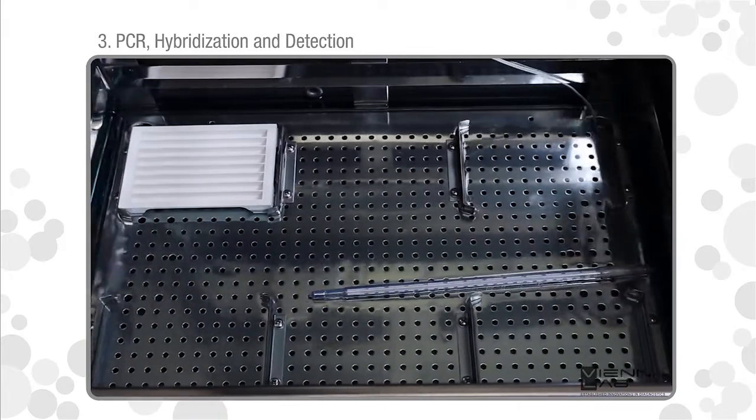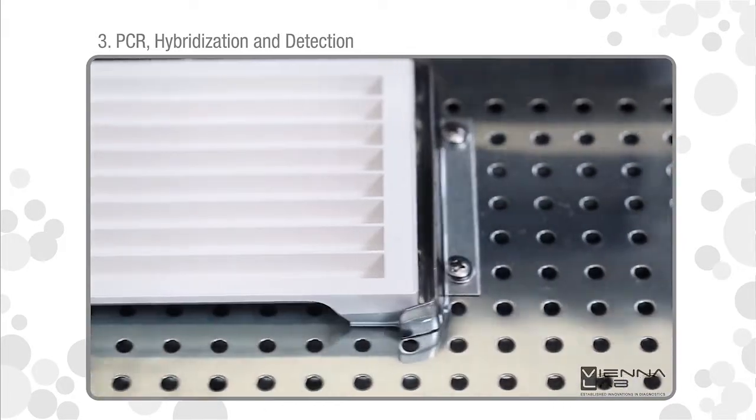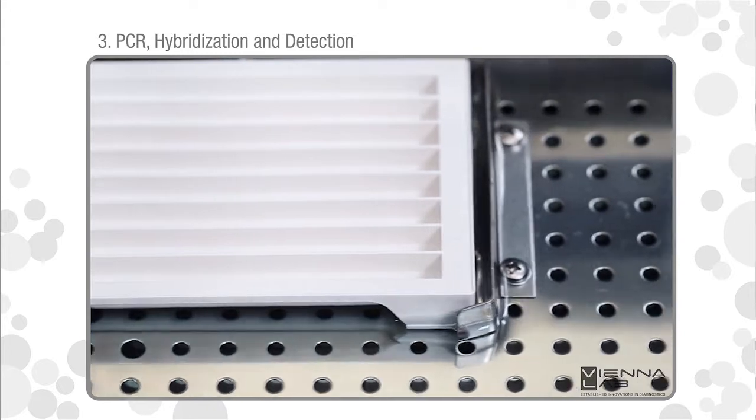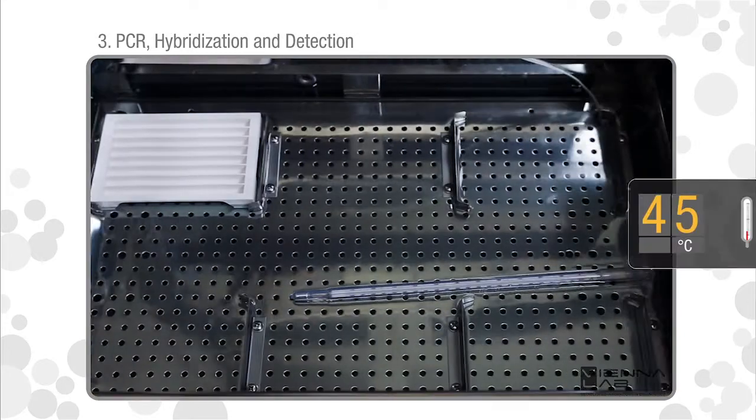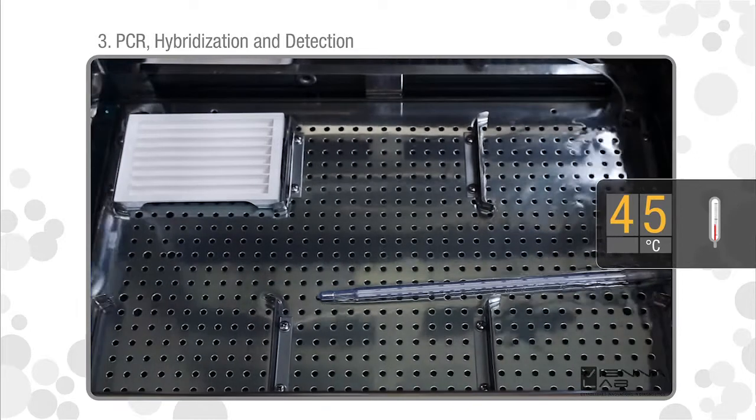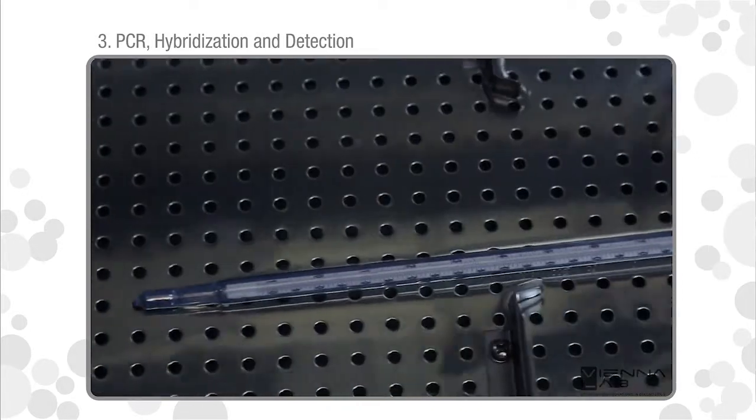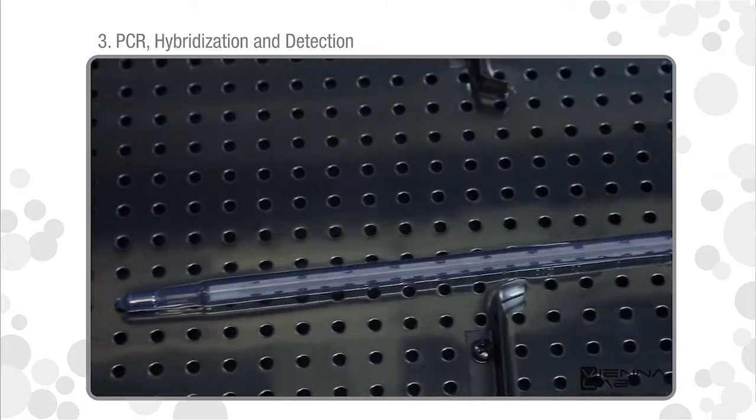Use a shaking water bath. Adjust the water level to approximately half of the height of the typing tray. Heat to exactly 45 degrees Celsius. Check water temperature with a calibrated thermometer.